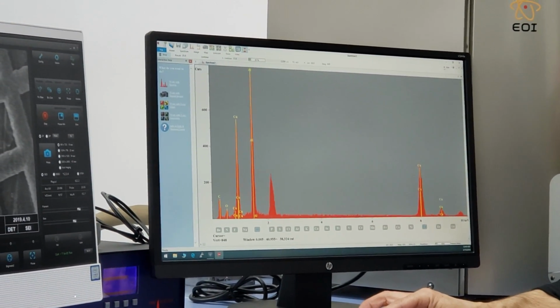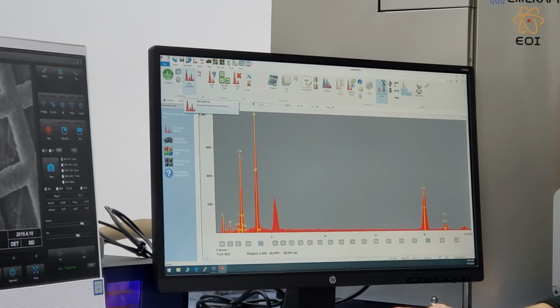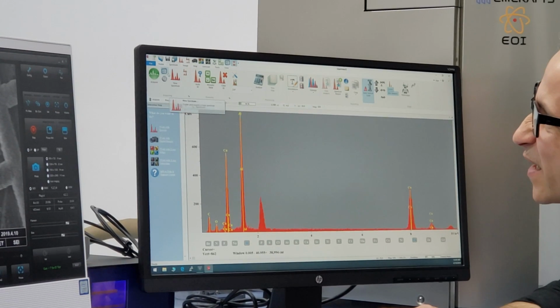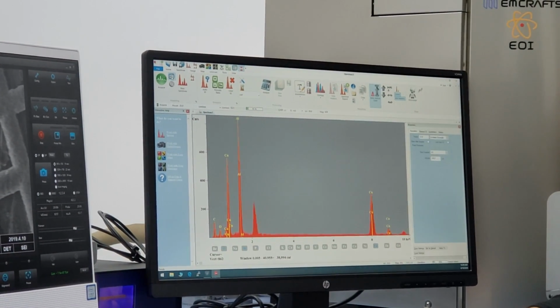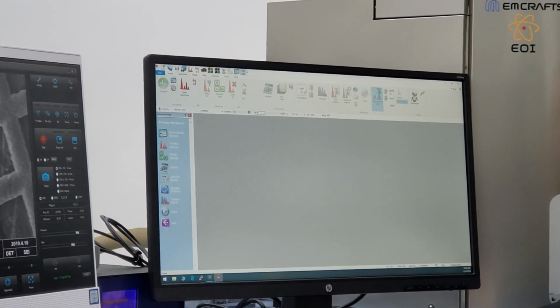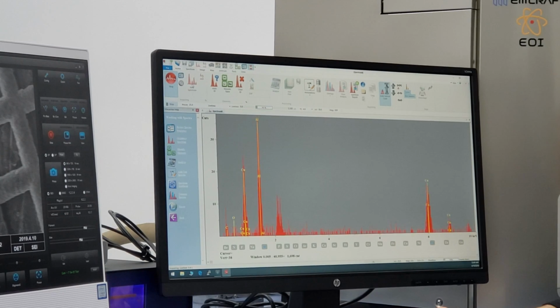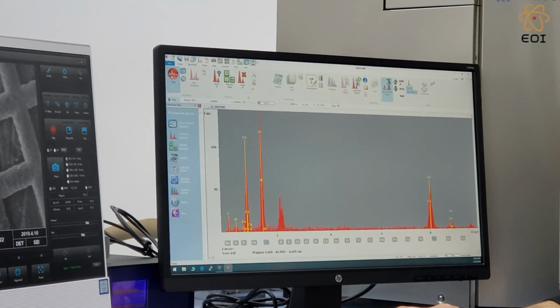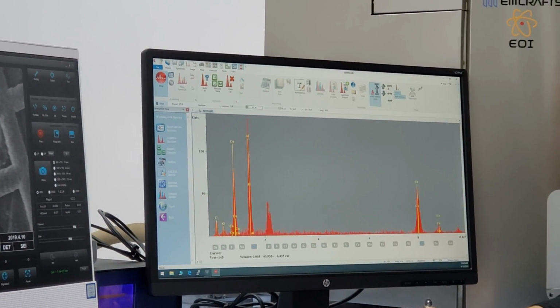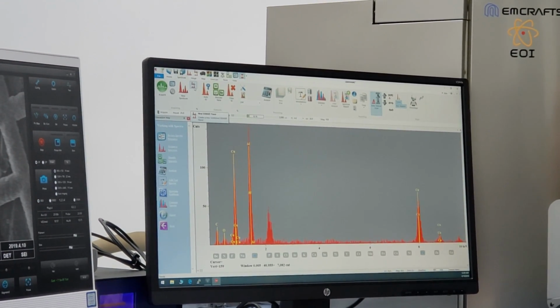And now if I want to view that information, let's just leave it up. So that acquired a spectrum. That's just properties. So that's the properties tab that we saw in the flowchart as well, right? This is just some settings, who cares? This acquires a spectra, great. Let's hit stop. That'll make things live again, alright? That's the XRF panel, we don't have it, so don't worry about it.